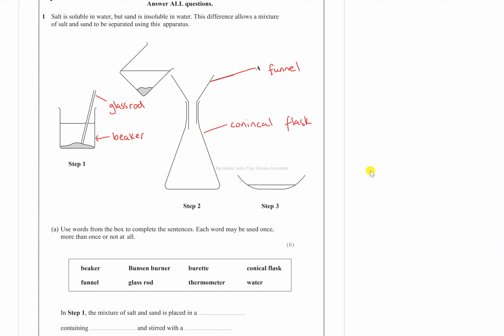You've got your evaporating dish or evaporating basin. I call it a dish. Some people call it a basin. Right, okay.